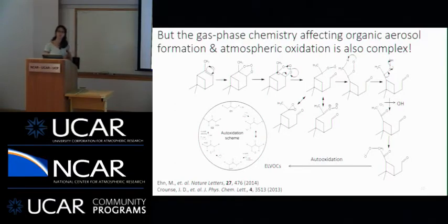And I think from a measurements and analytical chemistry perspective, trying to figure out how we can measure all of these intermediates, and some of them have very short lifetimes, so perhaps we don't measure some of these, but how do we measure compounds that have varying oxidation states, varying sizes, molecular weights, and such? And there have been some approaches, two-dimensional chromatography provides a lot of insight and a lot of information.